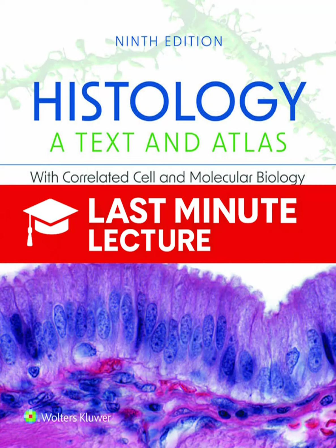Now we're getting into the advanced tools that let us optically dissect tissues. Light sheet fluorescence microscopy, LSFM, is one of the newest. LSFM is an imaging method that uses a very thin, flat laser beam, the light sheet, to optically section a transparent, fluorescently labeled specimen. And the key is that the emitted light is collected perpendicularly to that light sheet. So you're only illuminating the single plane you're looking at. Exactly, which minimizes the damage to out-of-focus areas and dramatically reduces phototoxicity. This lets you do long-term imaging of live, large specimens.